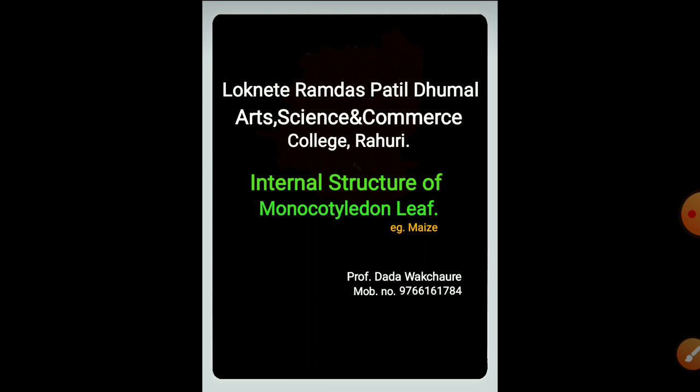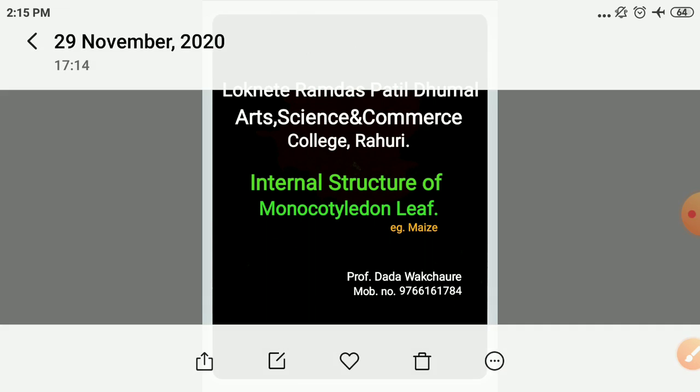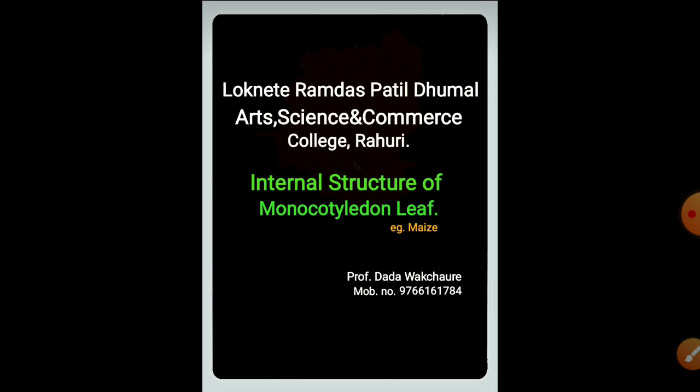Of these long photosynthetic organs, we have to study how they are composed internally, what structure the photosynthetic tissue shows, and what different types of vascular bundles are present in the transverse section. Besides this, we have to observe what type of mechanical tissue is inside the leaves of these monocots. Does the vascular bundle show any kavach, a bundle sheath, around it? All these things we have to observe.